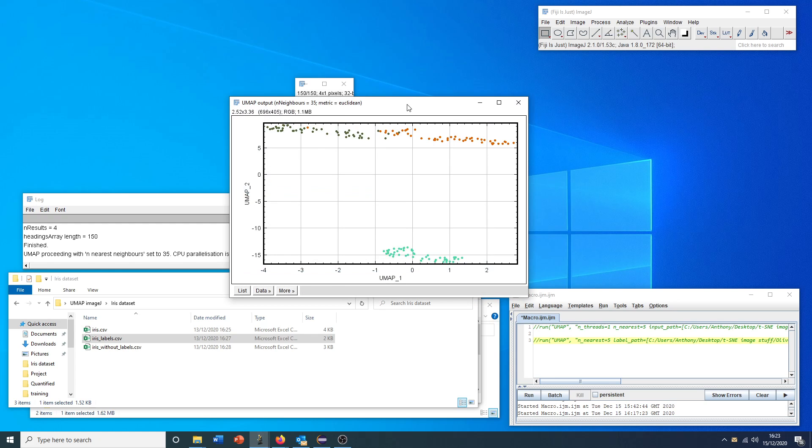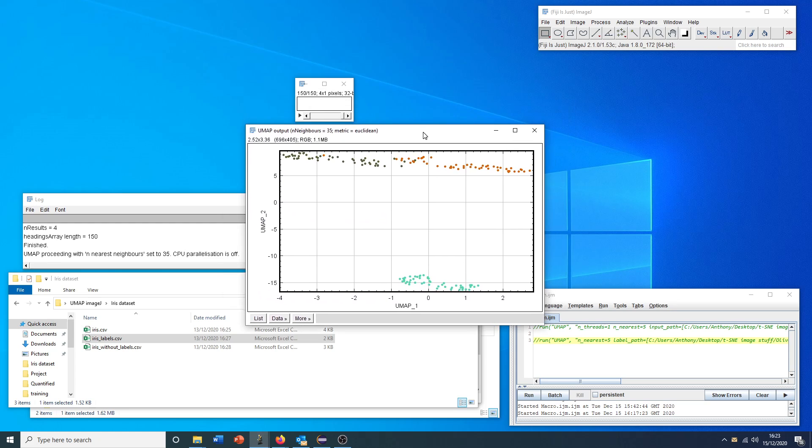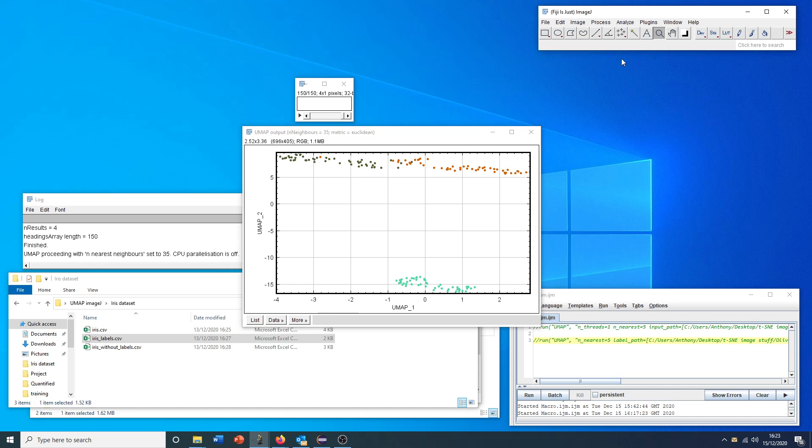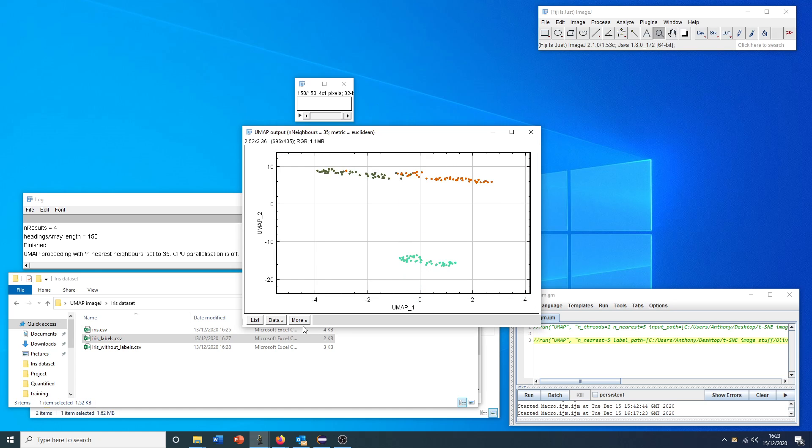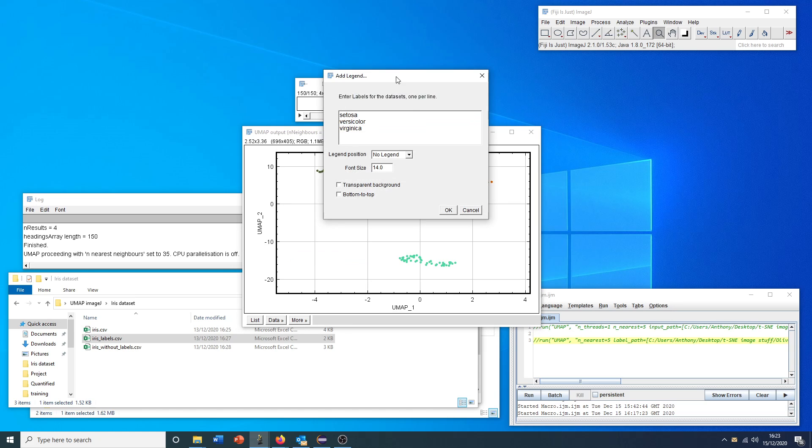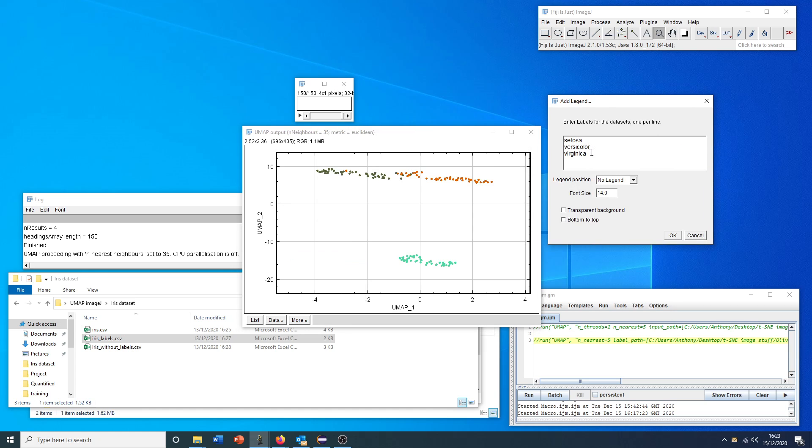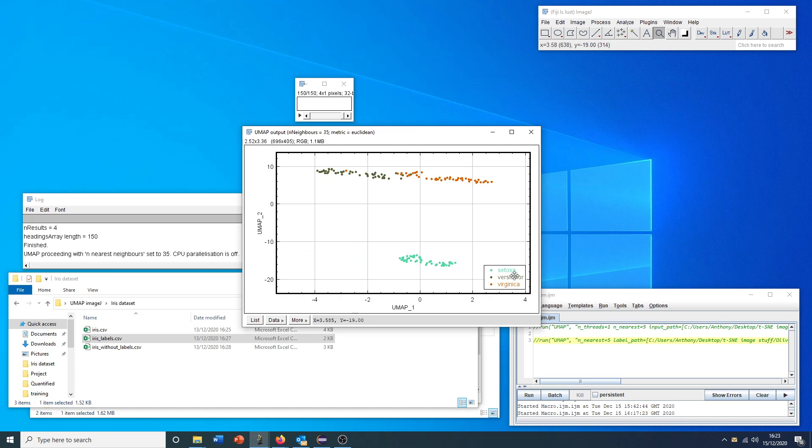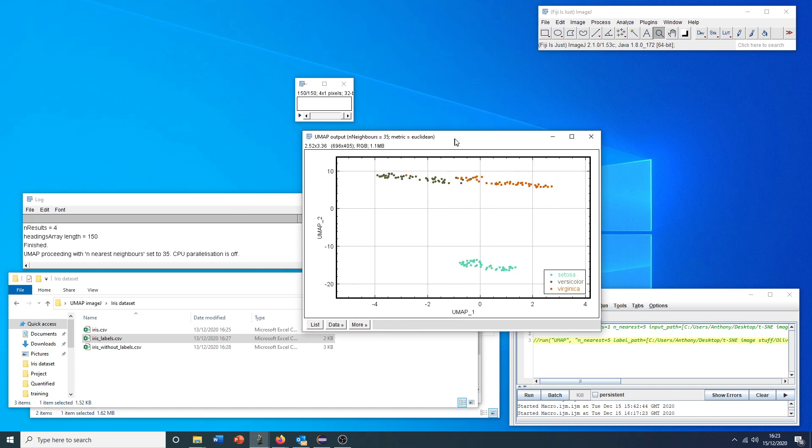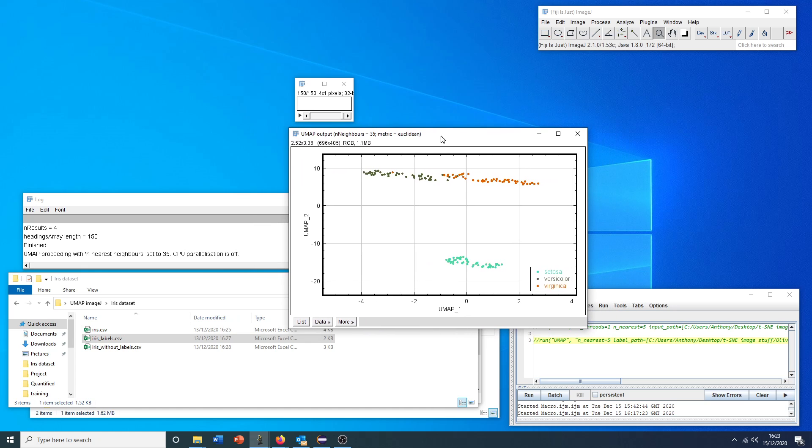If you Google UMAP iris dataset, this is a very similar output to what we would normally see. Just very briefly, I can add my legend as before. Here it's pulled this from the file, so this is why all these labels are here already. We can see that we have adequately or fairly nicely clustered our original dataset just on the lower dimensional representation of those four original flower parameters.